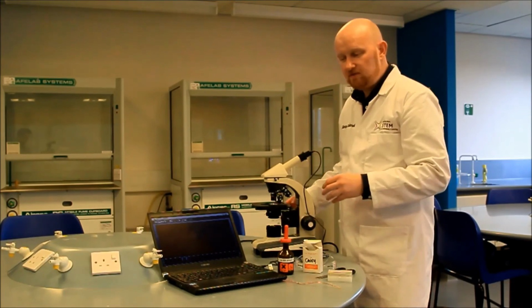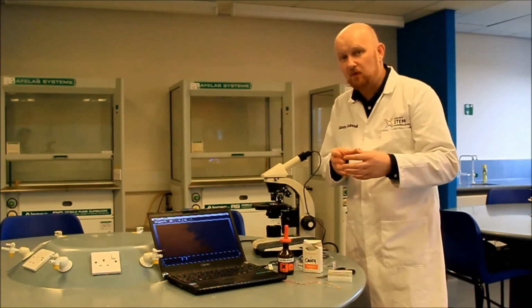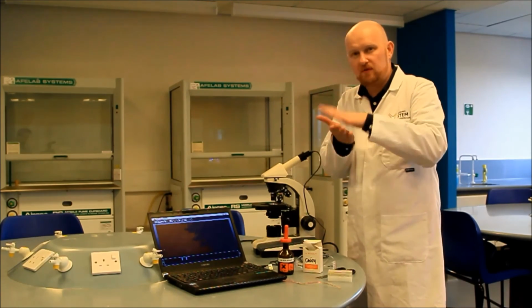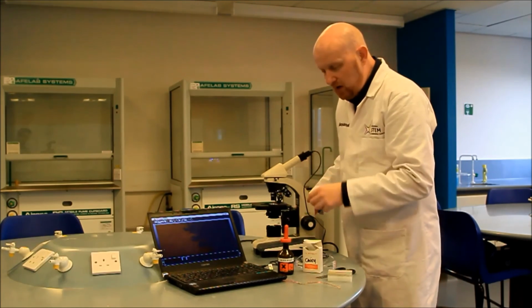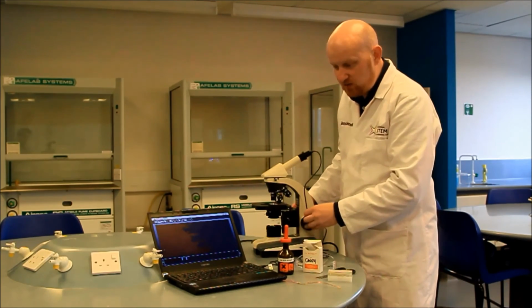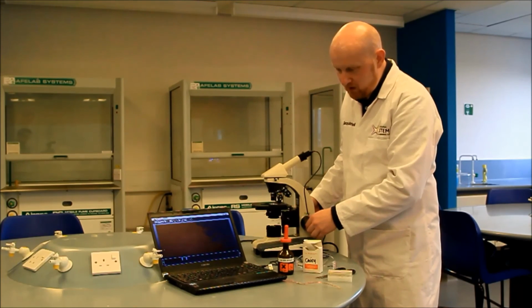Now, if you wanted to move the magnification up, you could put a cover slip on just to protect your lenses, because the higher you go up, the closer those objectives are going to be to the slide. But I'm just going to use low power for this, because I think that shows these off really nicely. And there we go. So those are our silver crystals growing on our microscope slide.